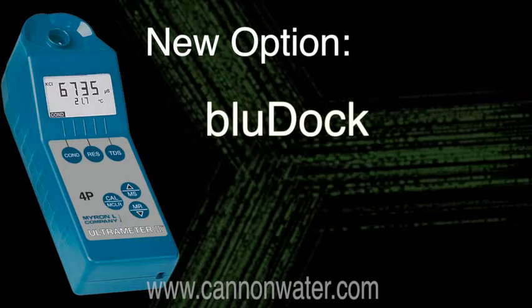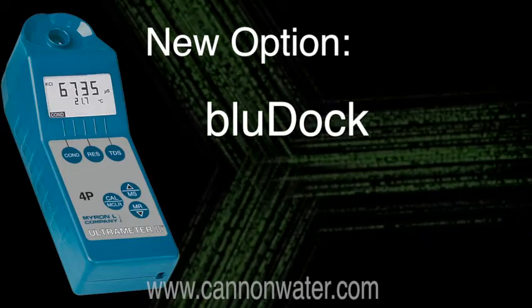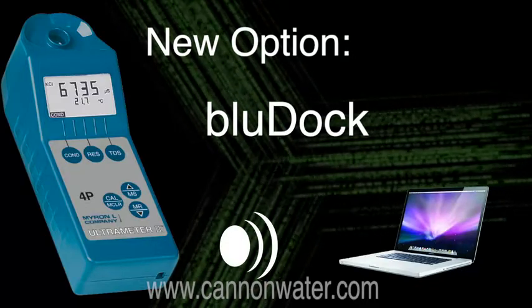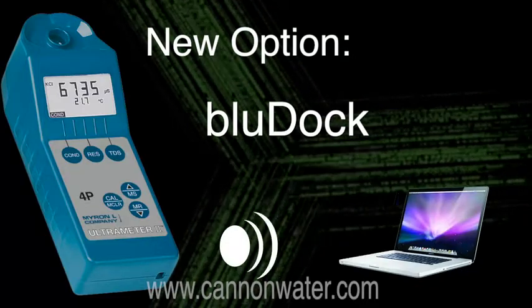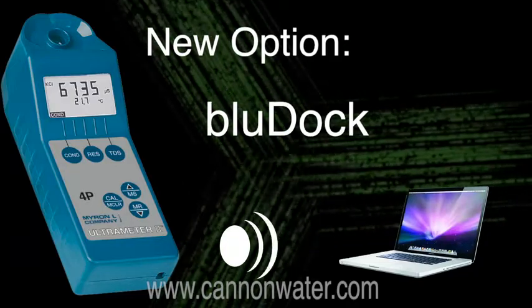The newest option for the 4P2 is BluDoc wireless capability. This means that the meter will store up to 100 readings and then transmit them wirelessly to your computer via Bluetooth technology. This will allow you to use the data for any type of reporting like spreadsheets or databases.